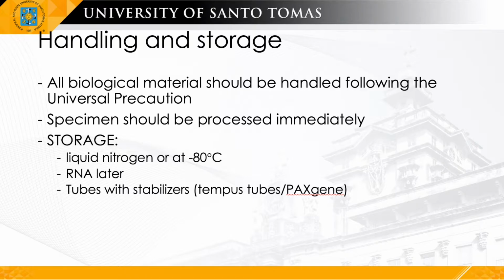There is what you call RNAlater. RNAlater is an aqueous, non-toxic tissue storage reagent that rapidly permeates tissue to stabilize and protect cellular RNA in situ in unfrozen specimens. Tissue pieces are harvested and immediately submerged in RNAlater for storage without jeopardizing the quality or quantity of RNA.